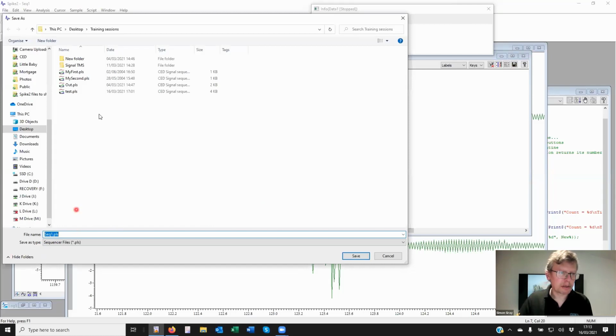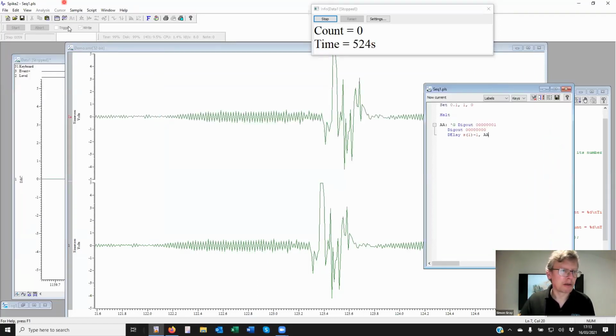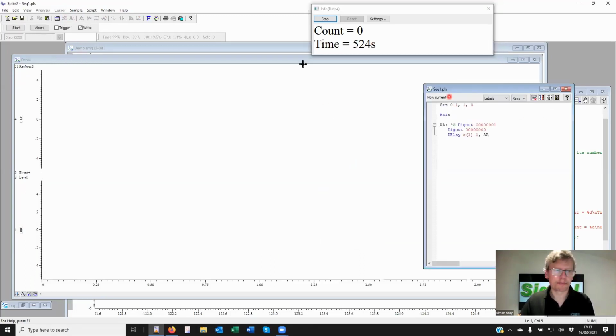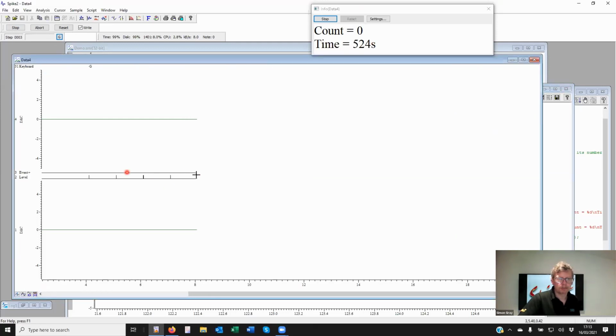I just set this, save. That seems to be all right. Usually my spelling lets me down here, but let's run this. The sequencer is now current. We'll start. I hope we've got everything connected. Okay, G. There we go. There's our pulses going out.